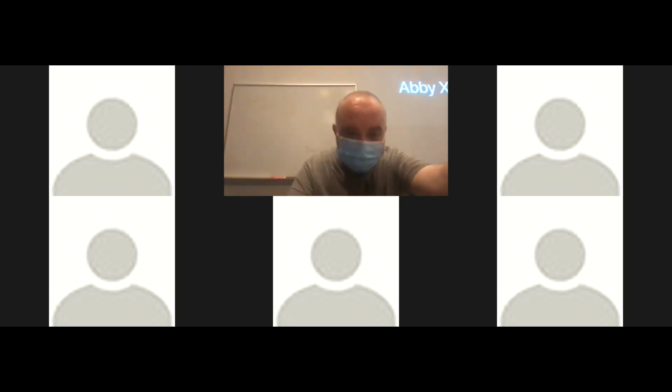I think, as I remember right, I'm not sure if anyone got to this part in the exercises. Let me know. But I remember that there is a problem with displaying this in IGB. Right? So if you had a problem, actually all you needed to do was right-click the axis and say reset data range. And it was just to do with when we do a log2 of 0, it breaks, right? So in this case, I think this is the problem here.